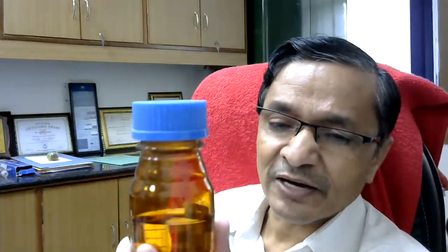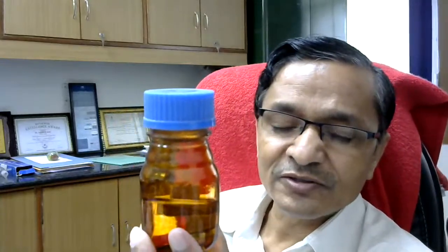Similarly, for some solutions or chemicals which should not be exposed directly to light, you should use this type of bottle. What type of bottle is it? Amber color bottle.